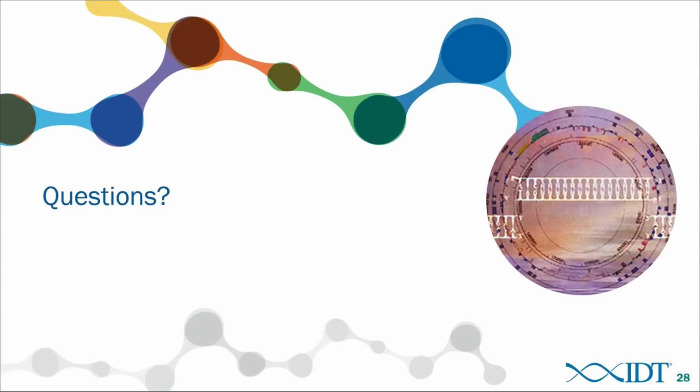We're getting close on time, but I'll try and squeeze in one or two more questions here. Our lab has already invested some time into designing G-Blocks gene fragments for single guide RNAs, and they want to know if it would be good to switch to the Alt-R CRISPR system before they make too much progress. No, I don't think there's anything wrong with using the G-Blocks.